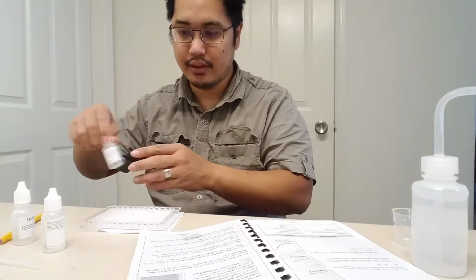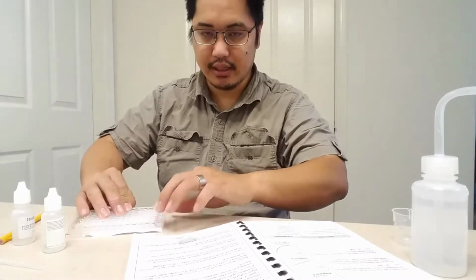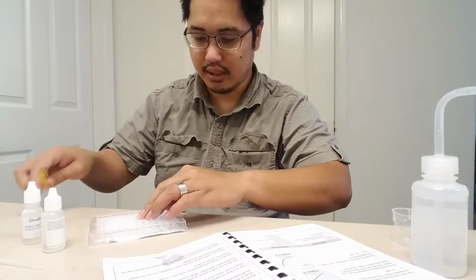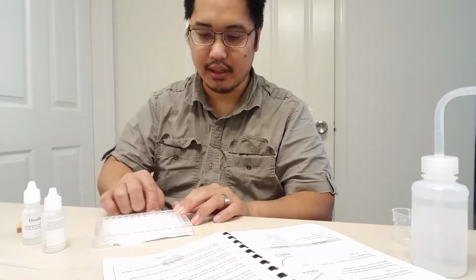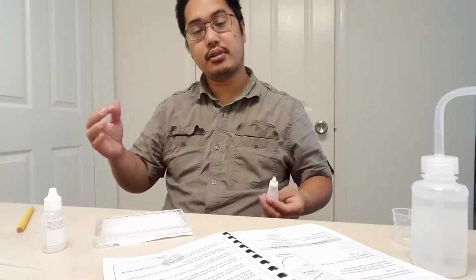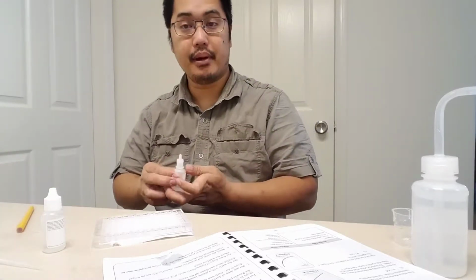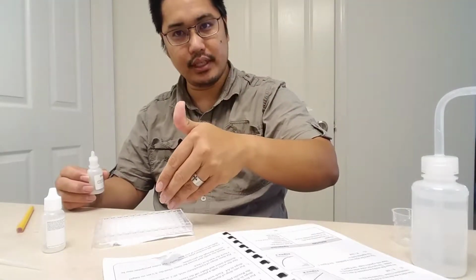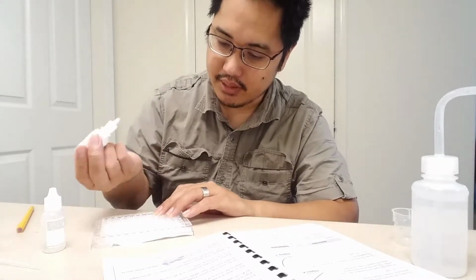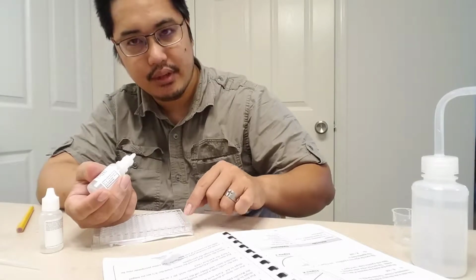Now I accidentally moved the sheet of paper. So just to make life easier, I'm going to line it up, then draw a little line right here. That way, if I ever move it again, I can just line it up with that little line, because these X's will become invisible. Now, I told you there needs to be 5 drops in each of these wells. I apologize for the camera angle cutting off the top of my head, but you'll want to see more of the table than my face, so that's why we did that.